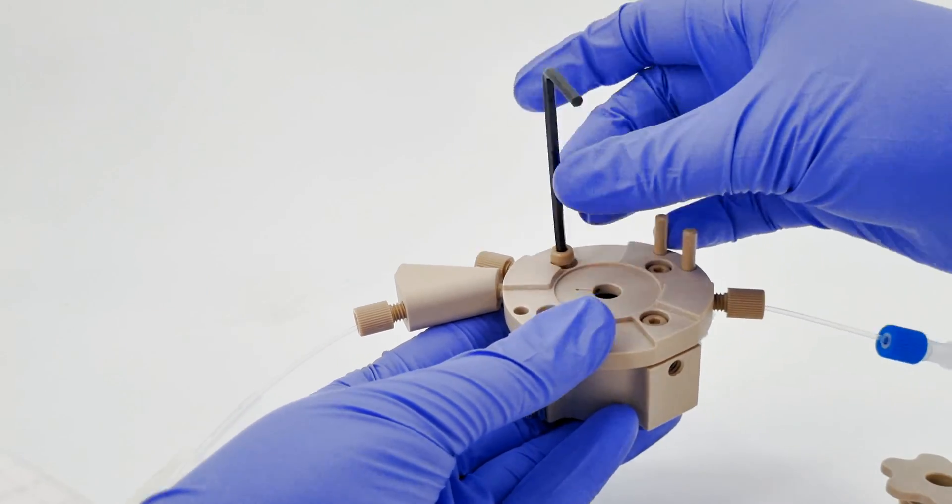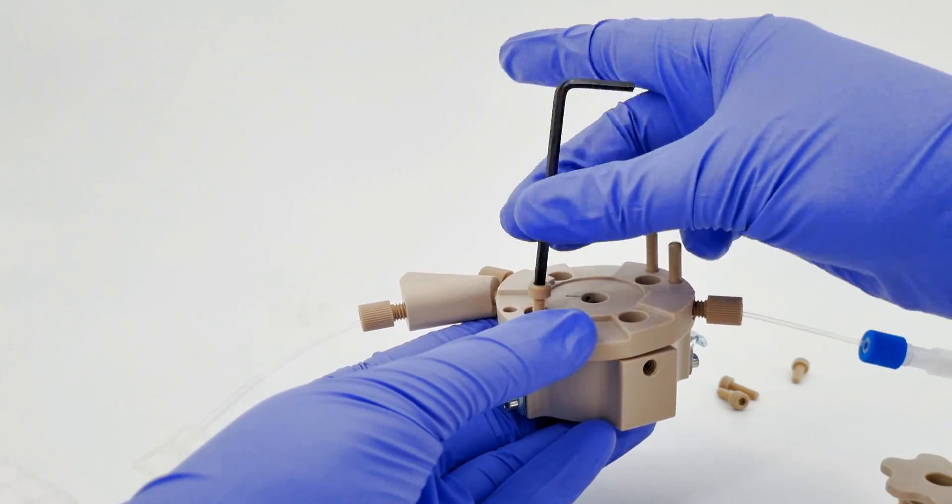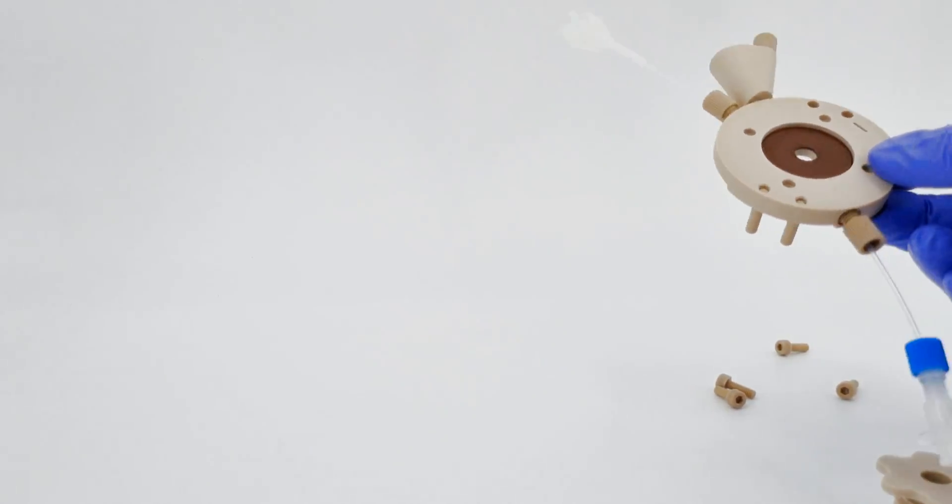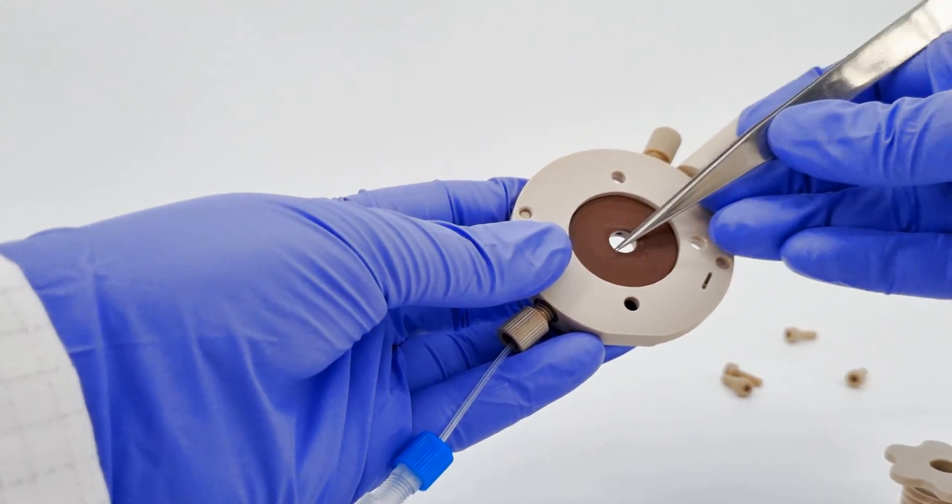To access the polarizing electrode gasket, start by unscrewing the four dedicated screws. Once separated, utilize tweezers to remove the gasket.